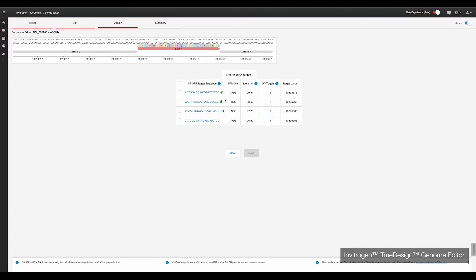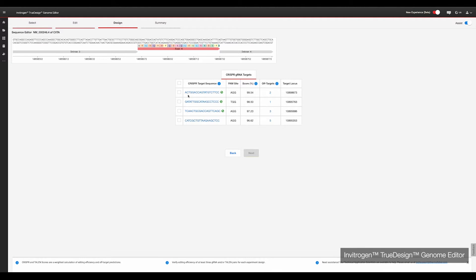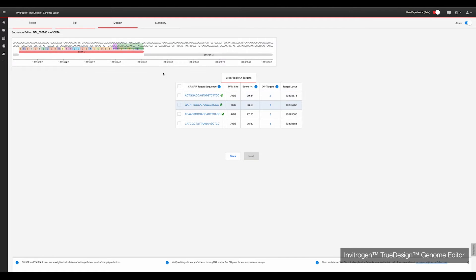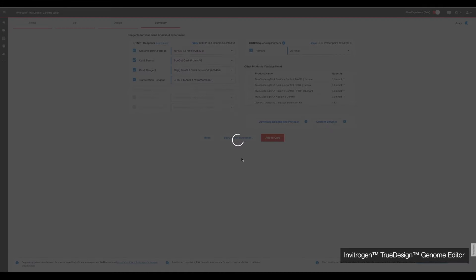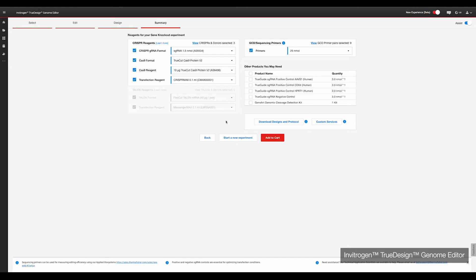TrueDesign will add green checkmarks to the top gRNAs it has identified. We recommend trying two or three gRNAs for each new gene target you are editing. Clicking on each gRNA will show you where it lines up with the site of interest, with the PAM site highlighted in the purple box. Simply select the gRNAs you wish to use via the checkboxes. Clicking next will take you to a summary page of the reagents you will need for your experiment. Simply select or deselect what you need via the checkboxes and use the drop-down menus to choose the amounts. Lastly, the software includes the option to add positive and negative control gRNAs for your experiment. These verified gRNAs are great for optimising your experiments for a new cell type.